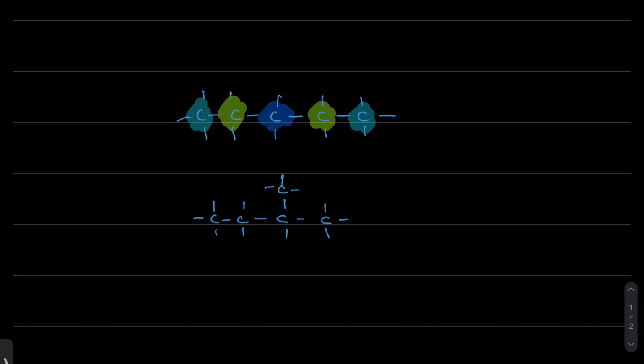Sir, what is a tertiary carbon? Like what kind of third carbon will come with it? A carbon attached to 3 different carbons. So for example, this carbon is attached to 1, 2, 3 different carbons. So it's a tertiary carbon. So one environment that I have is this one and this one because they're both attached to a tertiary carbon.